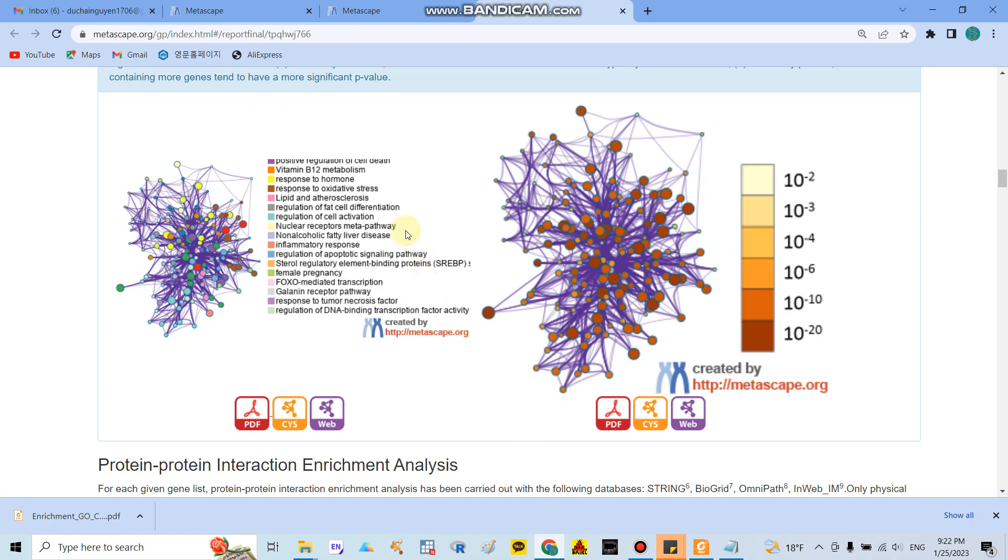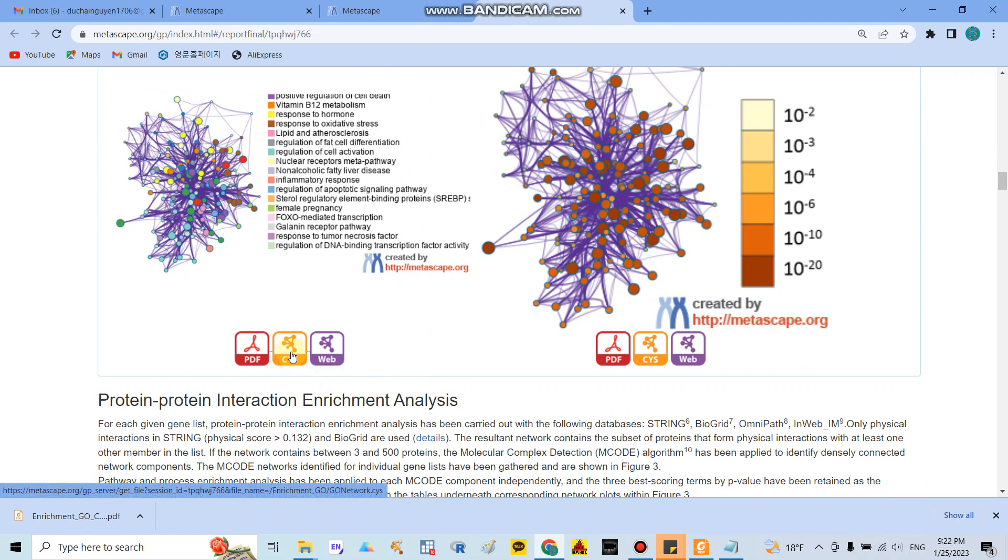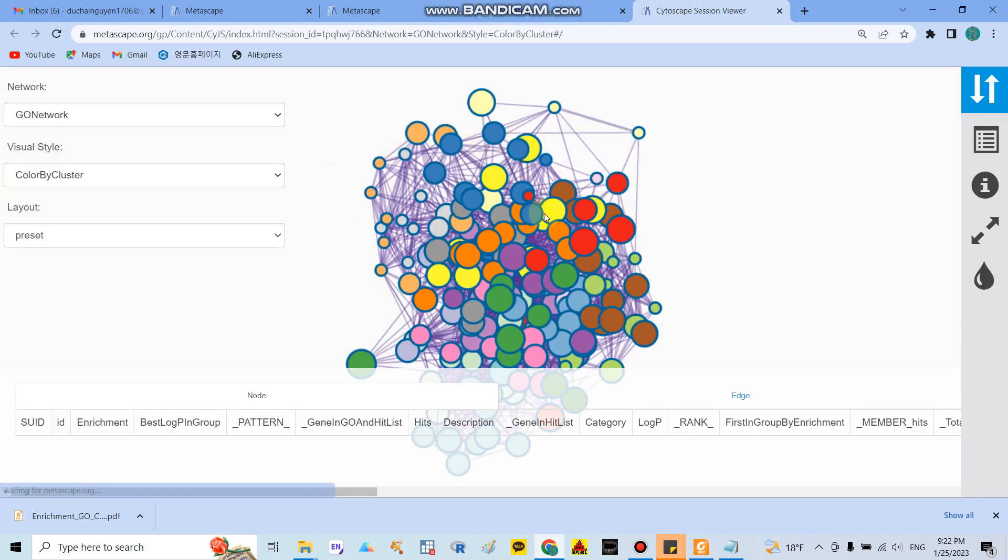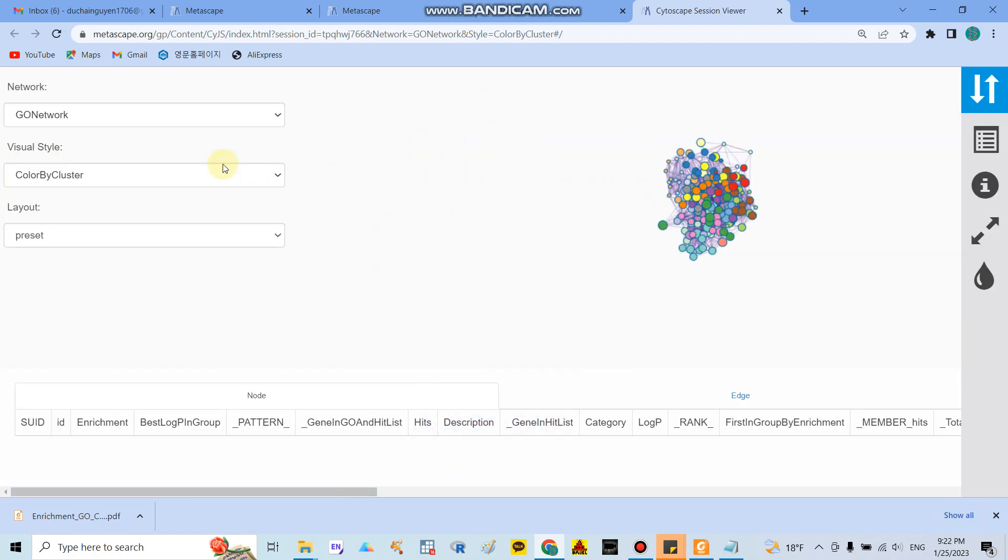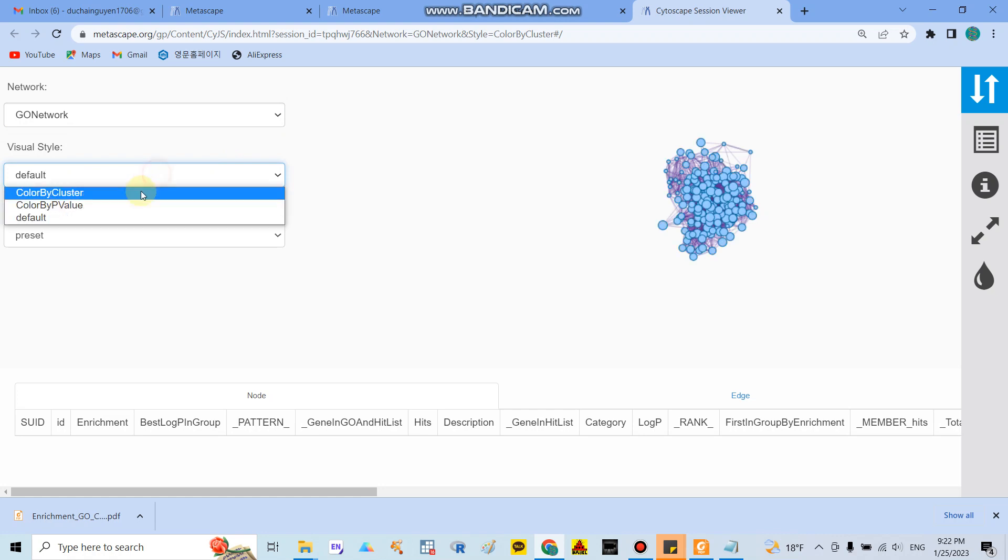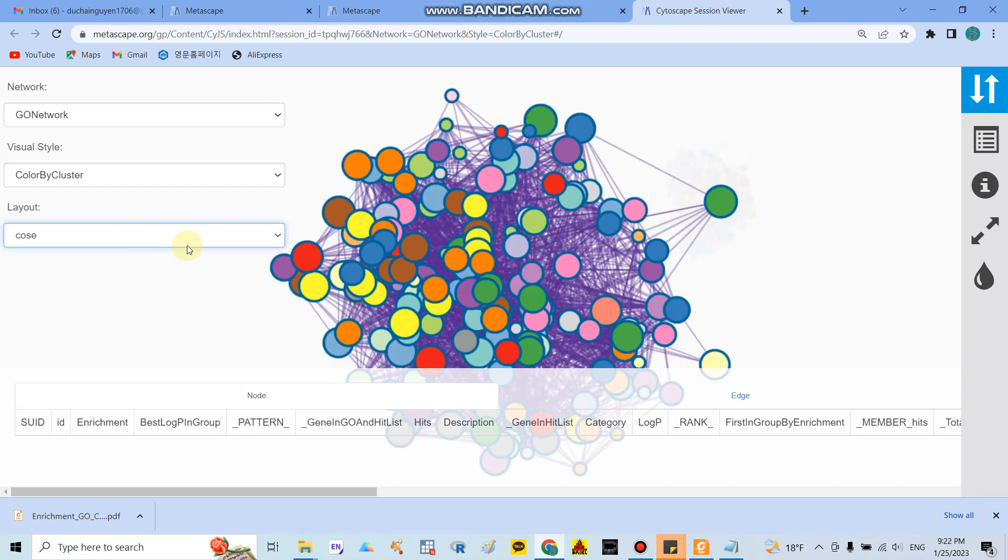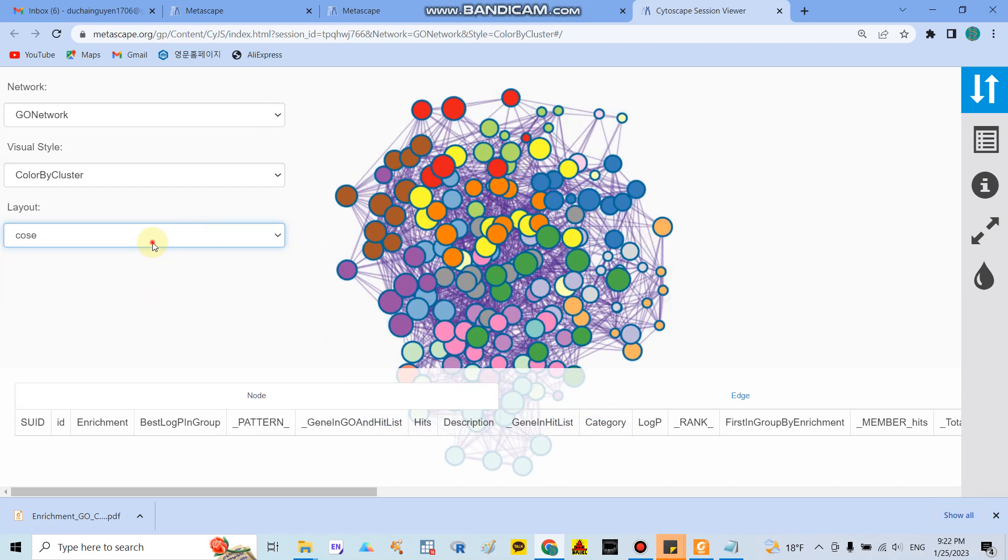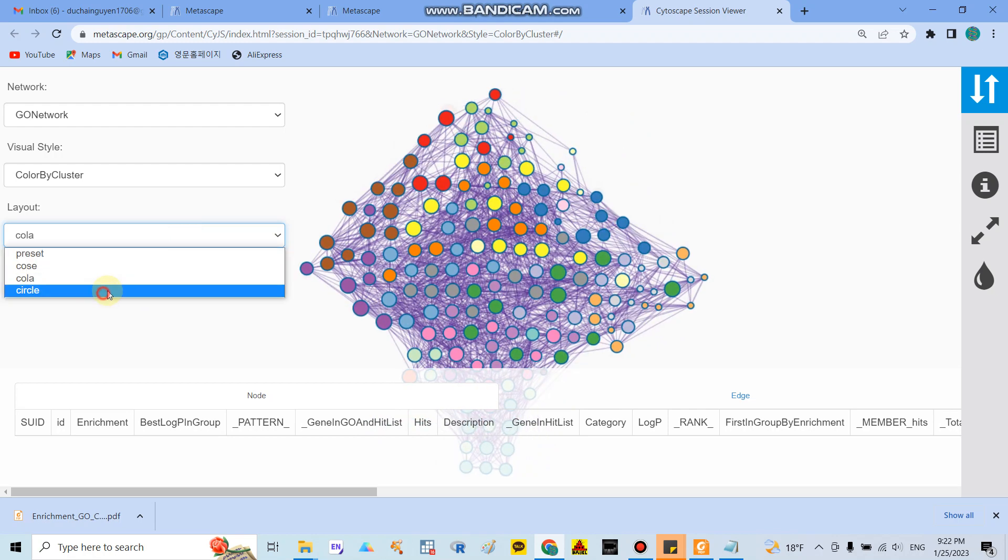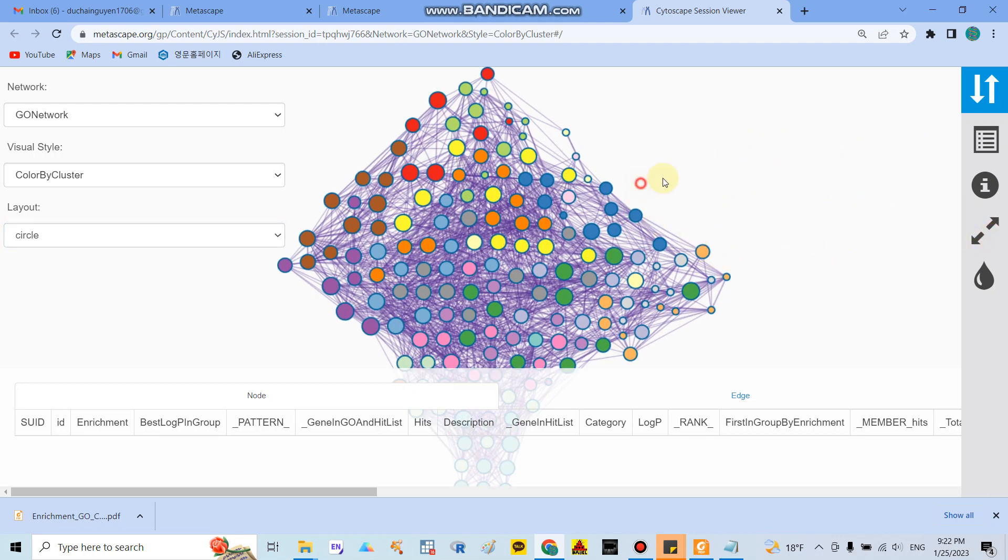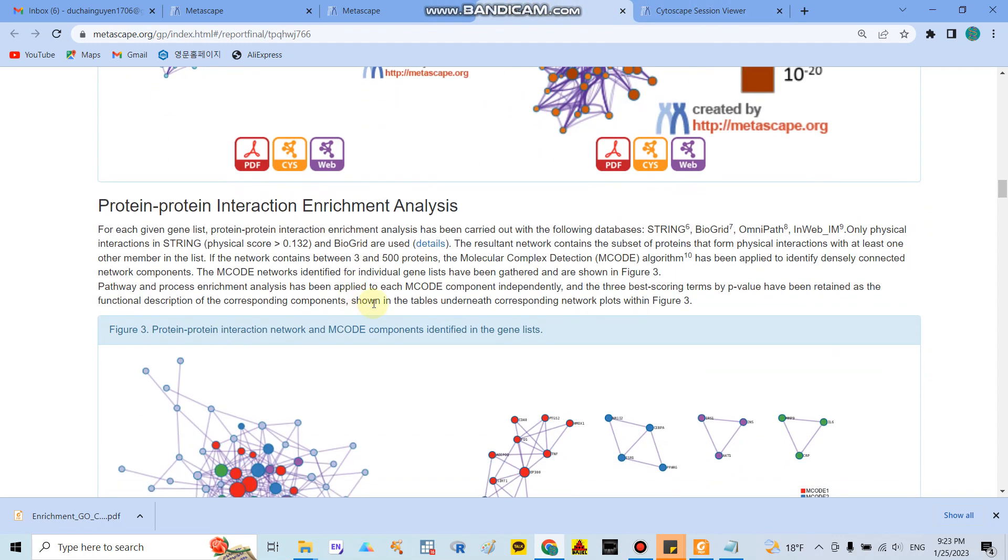Go back to the website and you can see here you also if you want to edit it you can click on the subset or you can go directly into the web here. And you can adjust everything you want in here and you can adjust the color by the p-values or you can adjust by default or you can decide by the clusters as I mentioned before. You can adjust the color, and just for the circle something like that everything you want. Because here they have no function to download, if you want you only take the screen shot and after that you can have the figure.